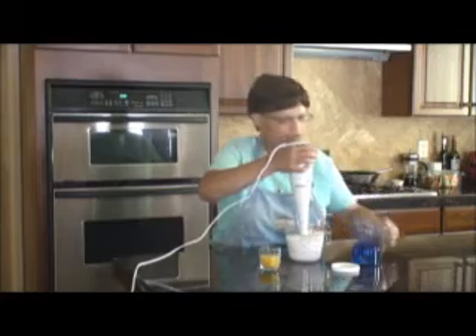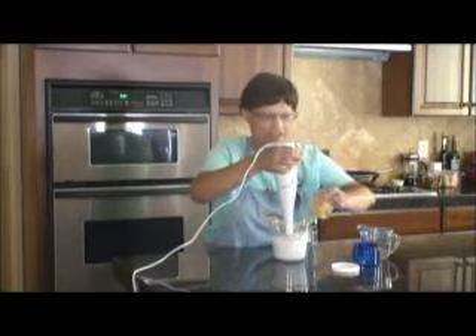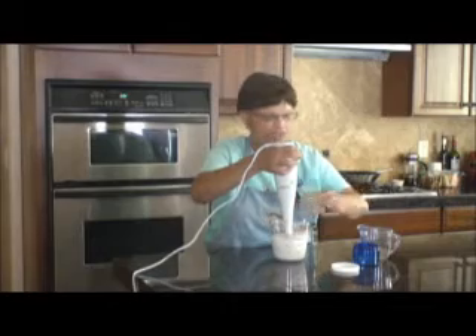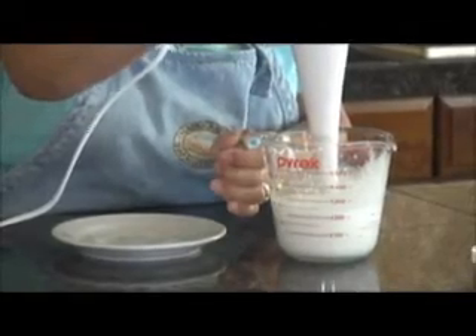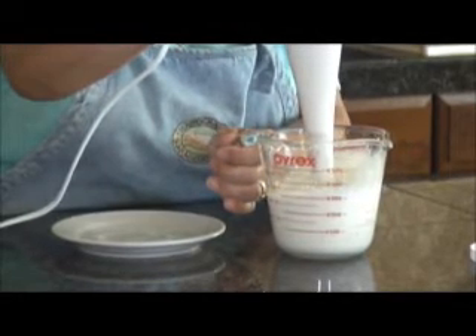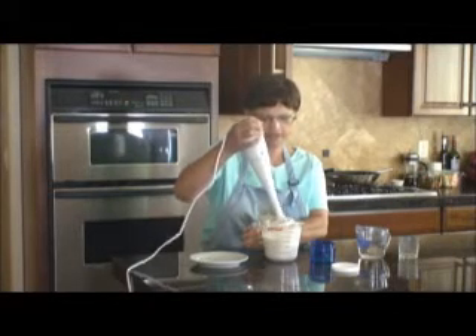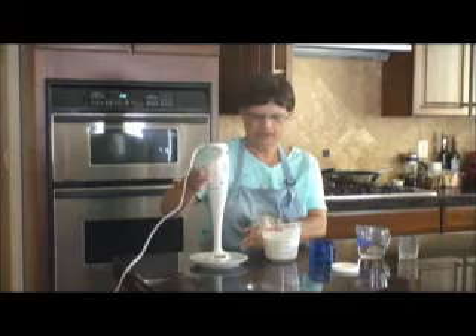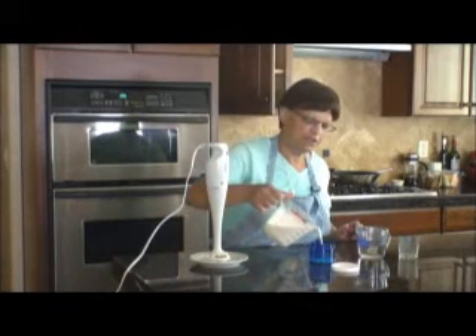Did you know that the FDA has guidelines for the sale of water-based solutions, such as lotions and creams, to which hand crafters should adhere? One aspect of FDA testing requires that your finished goods be practically free of contaminants such as yeasts, molds, fungi, and bacteria. Have you ever wanted to test your products to ensure sterility? Now you can without the expense of using an outside laboratory — you can do it yourself at home.